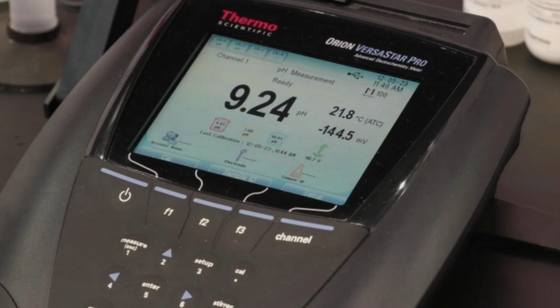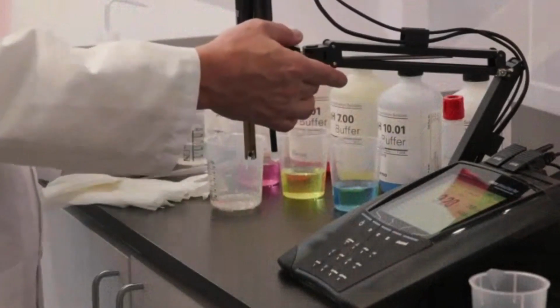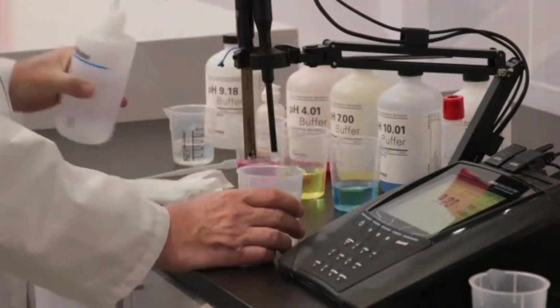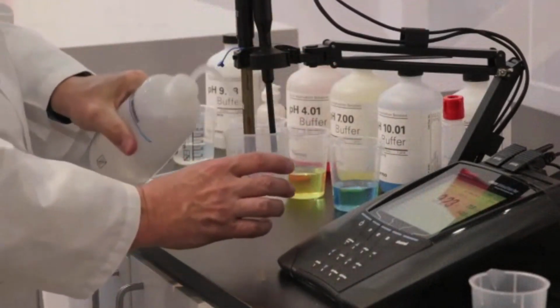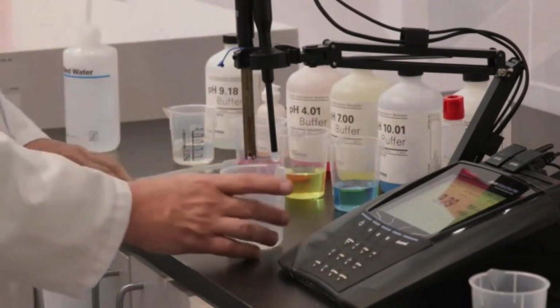All right. So Steve, let's show a little bit of maintenance that can happen at the end of the day that will help us make a quick, accurate calibration. Great. So he'll be rinsing his electrode carefully to make sure it's clean.